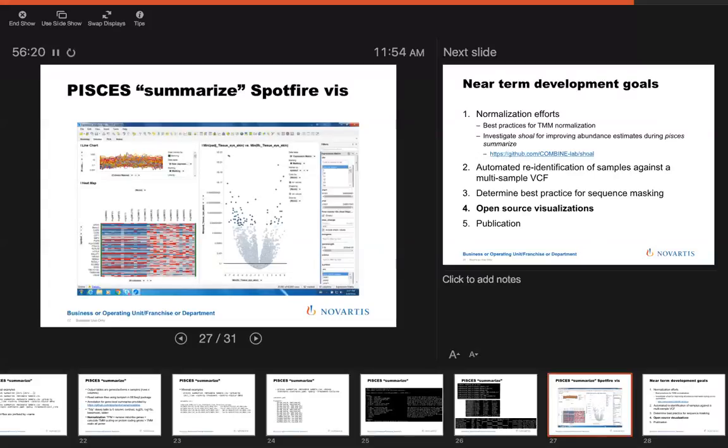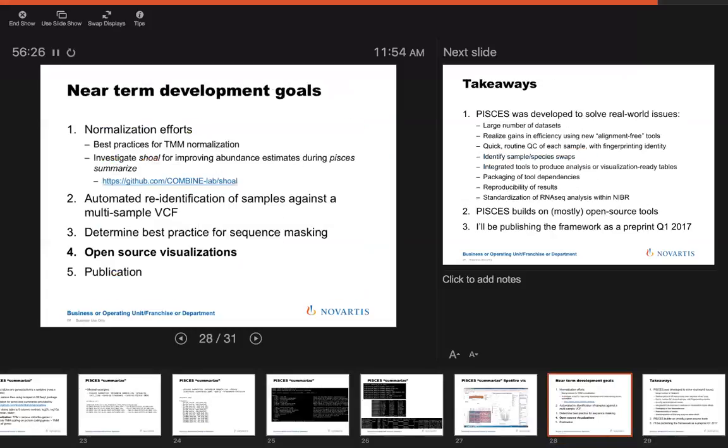So all of what I'm presenting is really driven by my use cases, and my biggest use case is speed, right? So I want to get the turnaround time from talking with the biology groups to sequencing to analysis down as quickly as possible. And sequencing, honestly, is the thing that takes the longest, but everybody's frustrated when they've submitted their samples for RNA-seq analysis and the sequencing has been done and the analyst just hasn't communicated anything back. And I'm trying to make that happen less and less. I don't know if that's a problem for you guys, but I think there's a big bottleneck for the bioinformatics analysis.